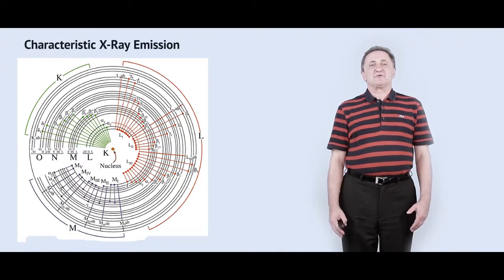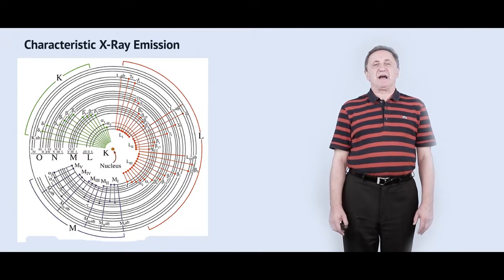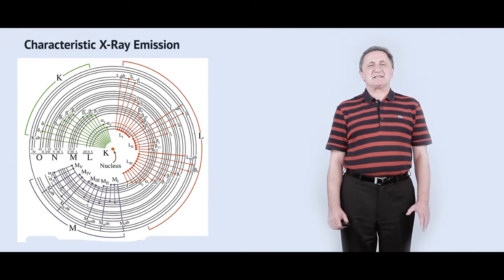Let's now move to the last possibility, the last kind of diagnostics which you typically have in your scanning electron microscope. I'm talking about energy dispersive analysis of X-rays. We have discussed briefly what is going on here.